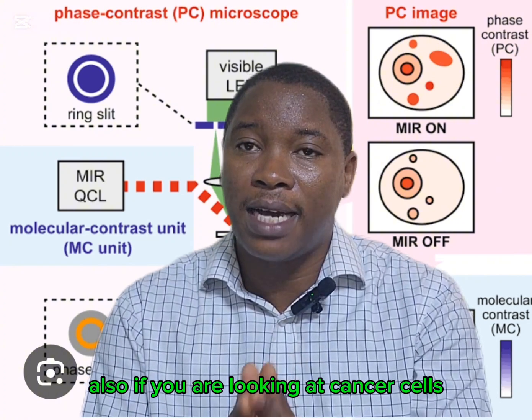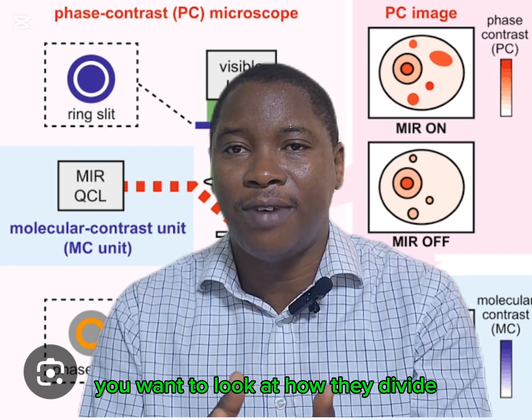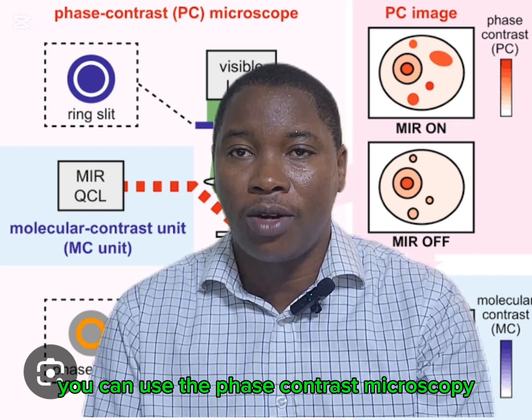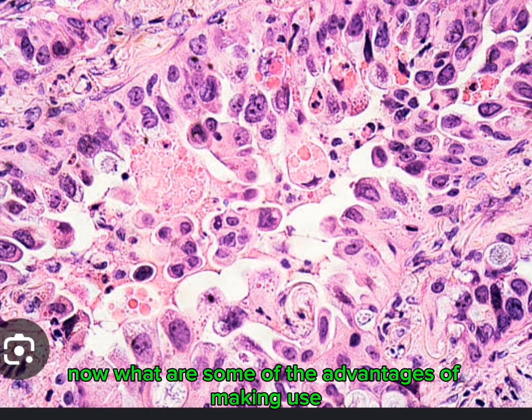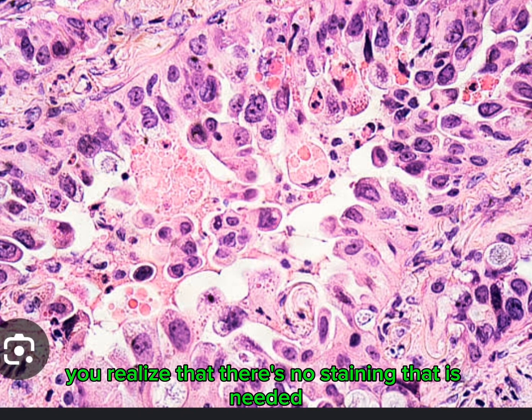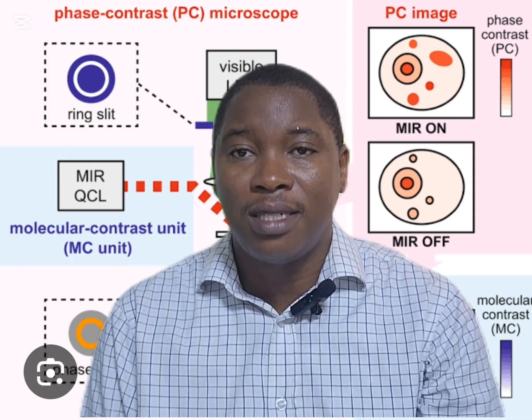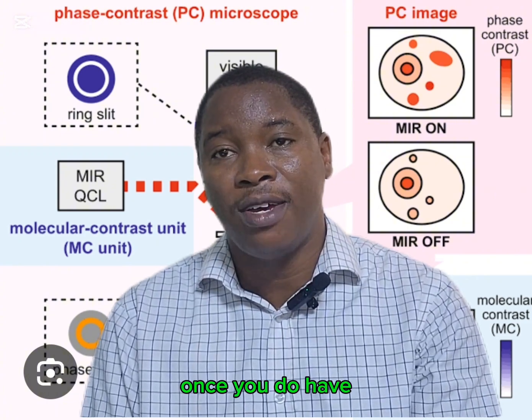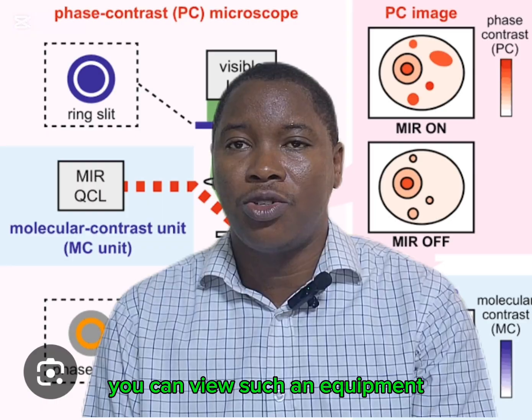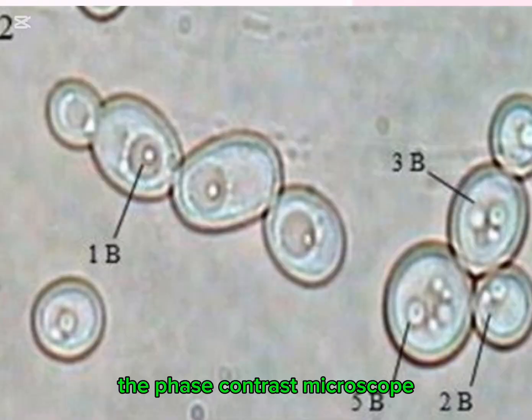Also, if you are looking at cancer cells and you want to look at their structure, you want to look at how they divide, all these things, you can use the phase contrast microscopy. Now, what are some of the advantages of making use of the phase contrast microscopy? You realize that there's no staining that is needed. You do not need to stain the specimen. It is cheap, it is easy. Once you do have the equipment, you can view with it. So these are some of the advantages of using the phase contrast microscopy.